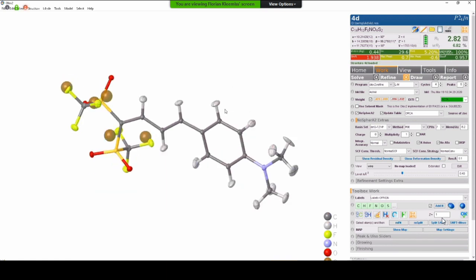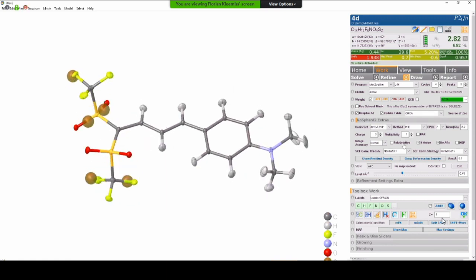In Hirschfeld atom refinement, as it used to be, there was a restriction that there cannot be any atom that is heavier than krypton. This we overcame recently by including relativistic all-electron basis sets, that is the X2C family of basis sets. The X2C family of basis sets has relativistic contraction in the atomic orbital coefficients. So this way you can use a relativistic Hamiltonian in your wave function calculation. And this way we can now tackle atoms up to radon.